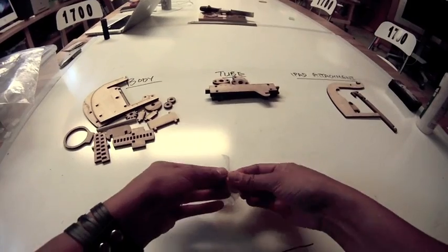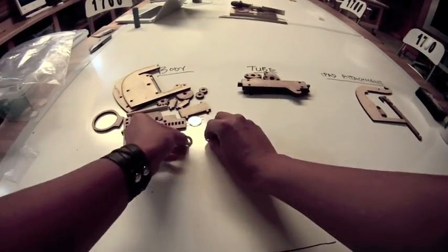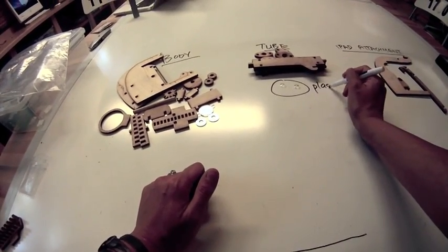Now take your little Ziploc bag and take out the things in there. You should see a mirror — that's part of the body — two metal washers, also part of the body, and then two clear plastic lenses. These are a little bit hard to see, so let me label them for you.